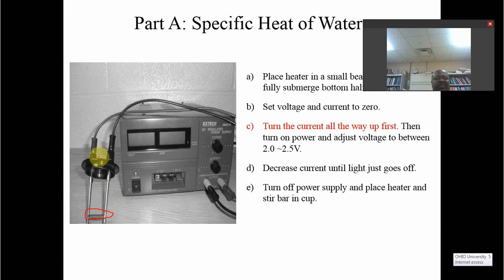And we're going to dip this in a styrofoam cup. There shouldn't be a copper metal here. There shouldn't be anything at all. The only thing that we're going to put in here is a small temperature sensor. Okay. And this is going to go in a styrofoam cup.